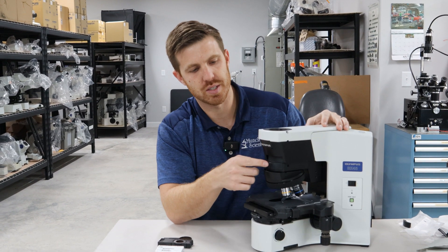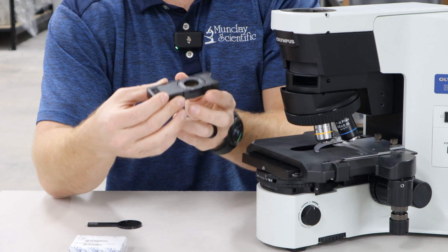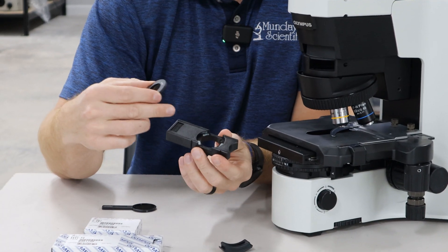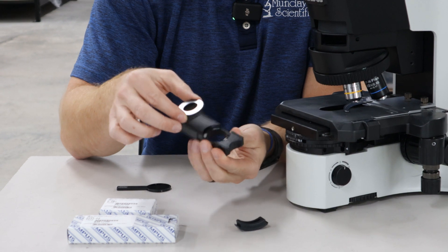A lot of these scopes will have a dust cap that just pops right out, and then you'll have the analyzer. The analyzer is just this round disc and it fits in the analyzer holder. There are magnets on the back and it has a pin, so it'll only go in one way.